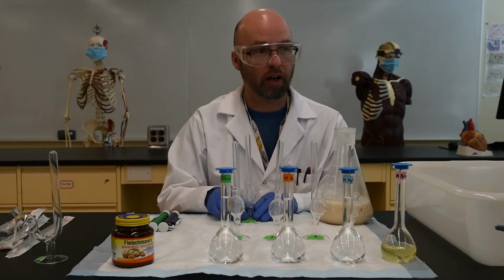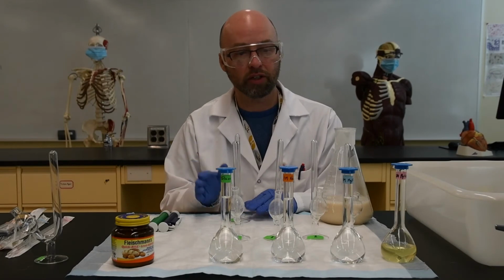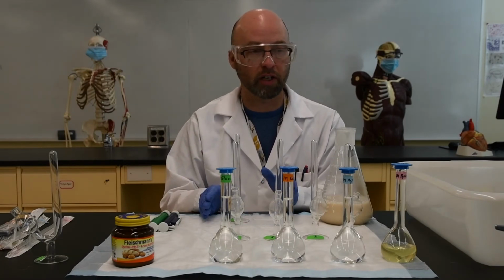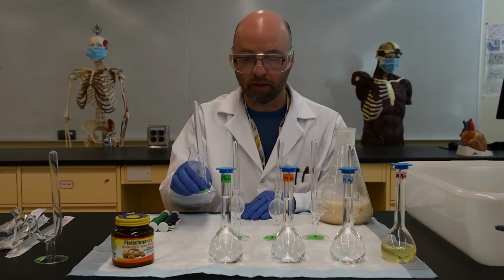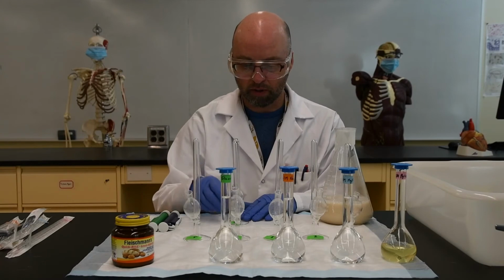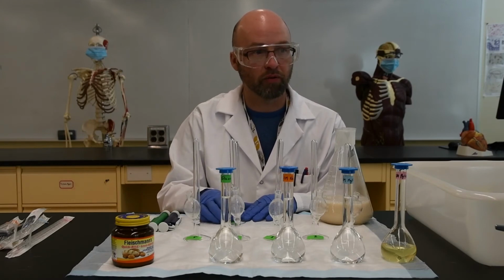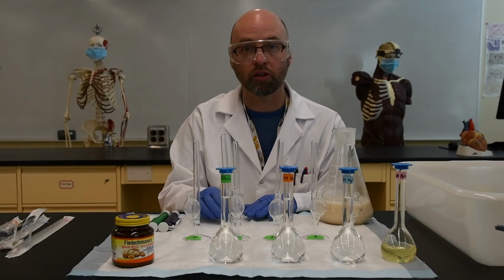Tube number 5 is the pyruvate tube, so this one contains 2.5 ml of pyruvate. It also contains 2.5 ml of the inhibitor, sodium fluoride, and 2.5 of glucose, and 10 ml, of course, of yeast. And the final tube will contain 2.5 ml of glucose and 15 ml of water, so no yeast in tube number 6.